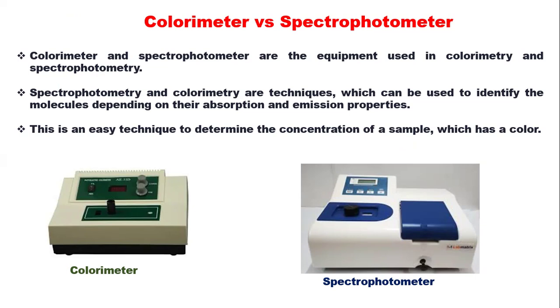To measure their concentration, you have to mix them with a substance that is known for its color, and you extrapolate the concentration of the other one that is not colored.